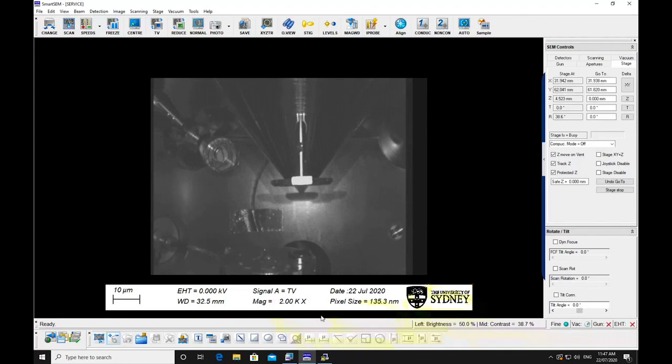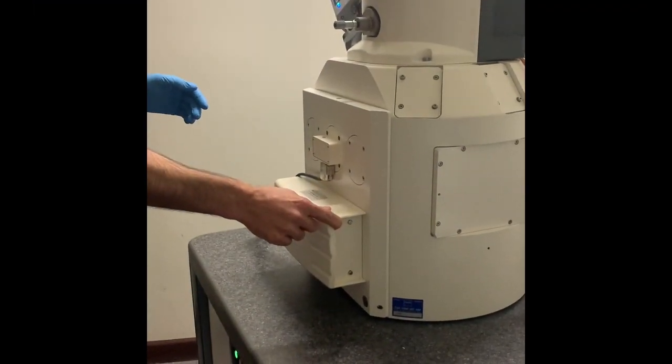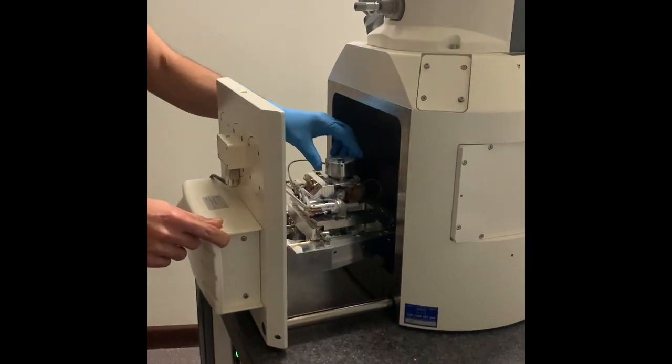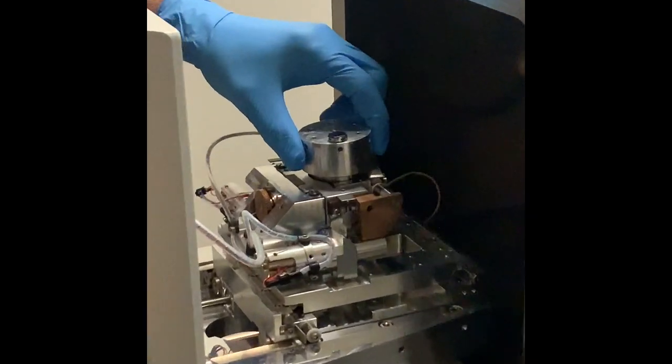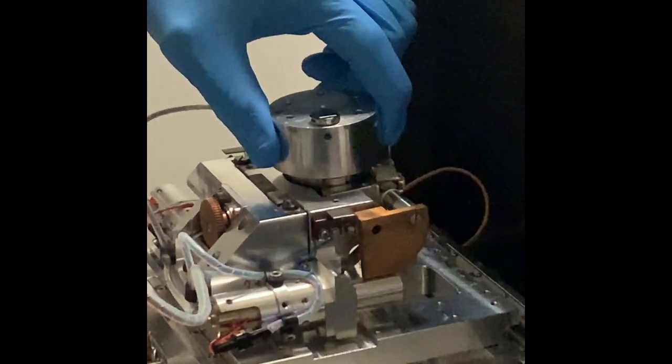Put on a glove. Once the chamber has reached air pressure, remove the specimen holder, then close and pump down the chamber.